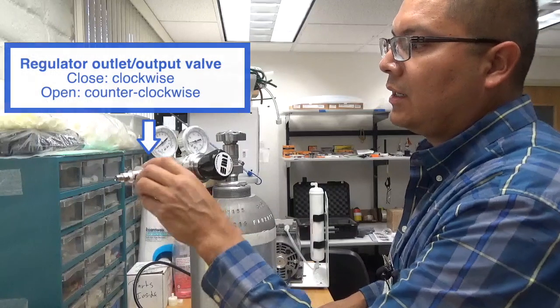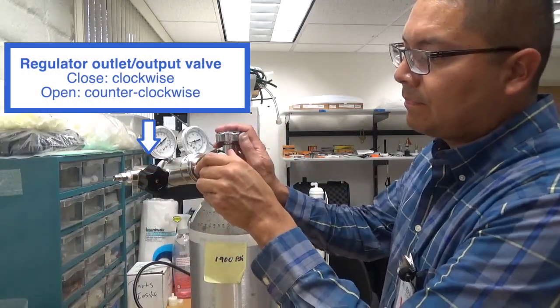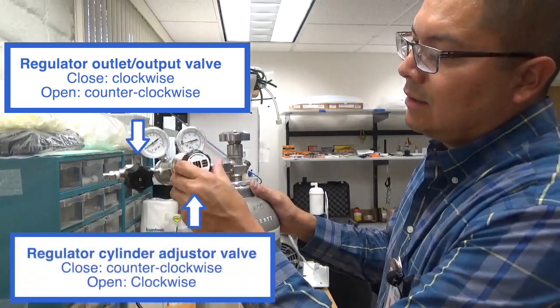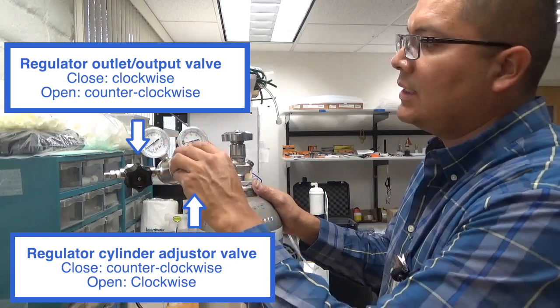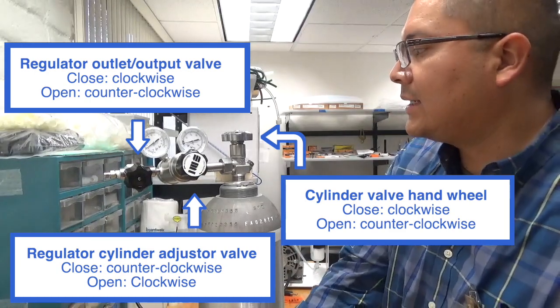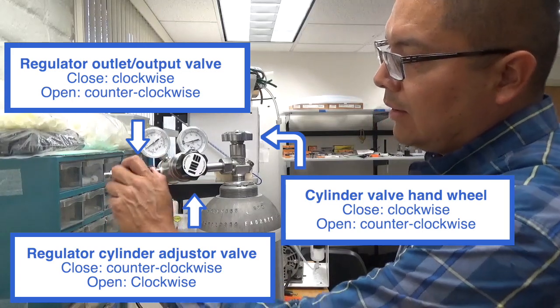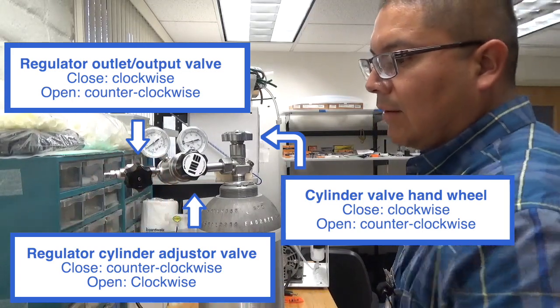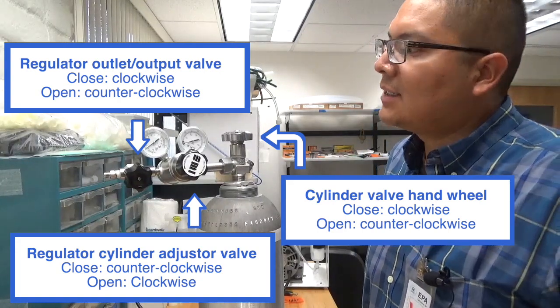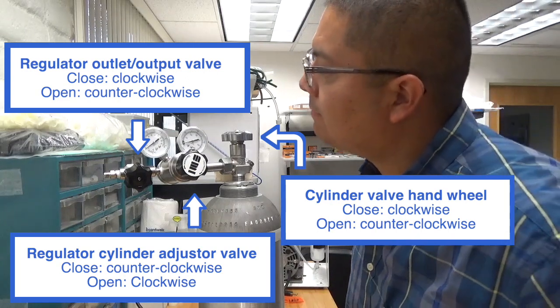The next thing you want to do is make sure your valves are all closed in the closed position. As you can see on here you'll see increase and decrease. You want to make sure you close this valve which is the valve that regulates the gas cylinder. And this is the valve that regulates the gas that's coming out of the regulator, typically to your calibration gas system or dynamic dilution calibrator.